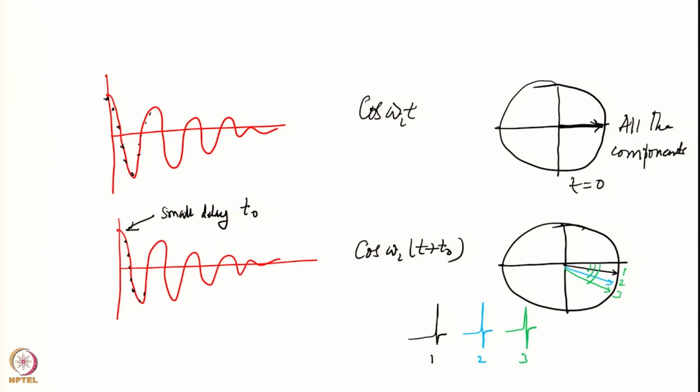So different ones will have different mixtures. This is what we call a frequency dependent phase shift, and these are all in the real part of the spectrum. A similar thing will happen in the imaginary part of the spectrum.